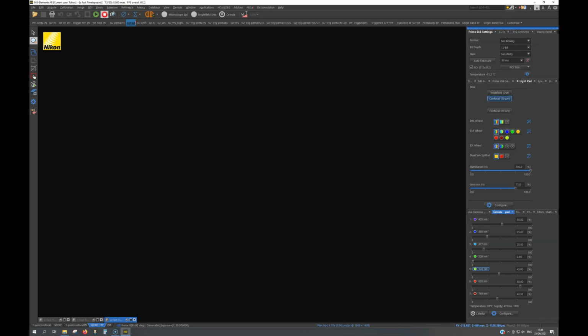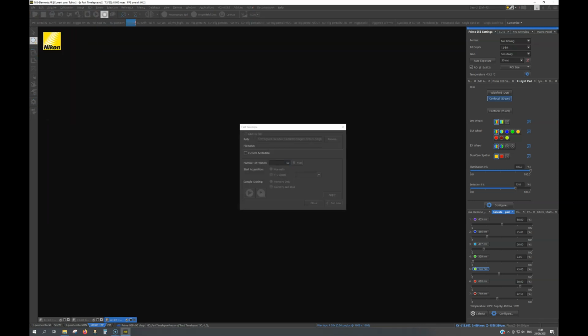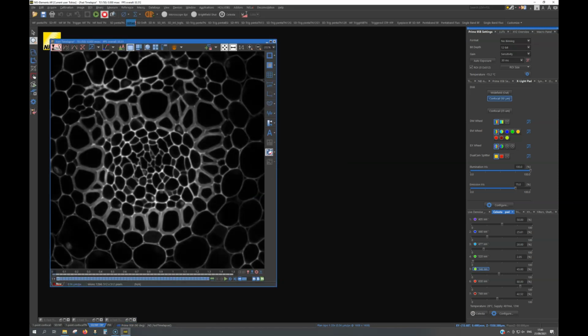In our earlier acquisition of the single-point confocal resonant images, we had a total frame time of around 33 milliseconds, so acquiring multi-point confocal images with 30 milliseconds exposure time gives us a possibility to make a comparison of the image quality we can receive if we use the same exposure time. We will do this comparison in a bit. First, we will make a quantitative comparison of our results for the multi-point scanning confocal.